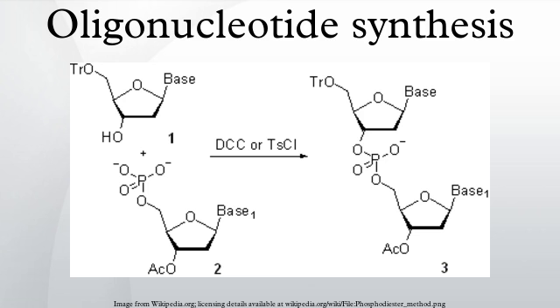This platform was originally designed as a peptide synthesizer and made use of a fluidized bed reactor, essential for accommodating the swelling characteristics of polystyrene supports used in the Merrifield methodology. Oligonucleotide synthesis involves the use of CPG, which is a rigid support and is more suited for column reactors as described above.